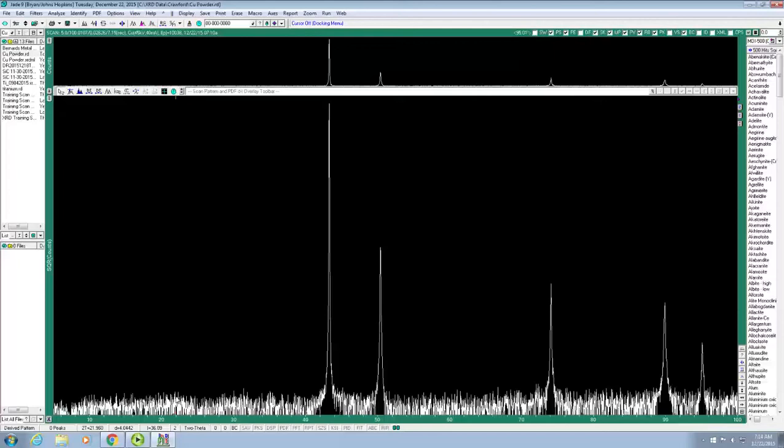By using a zero background slide, that will eliminate almost all of this background noise that we see in this area. And that will also allow you to see a much smaller signal from a lower density of particles. Since I had a lot of copper powder, it didn't matter, and we see these nice clear peaks.